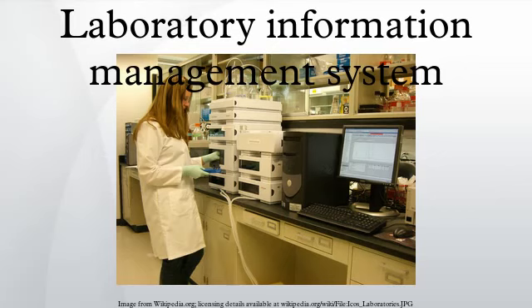Standards. A LIMS covers standards such as 21 CFR Part 11 from the Food and Drug Administration, ISO/IEC 17025, ISO 15189, Good Laboratory Practice. See also: List of LIMS software packages, Virtual Research Environment, Laboratory Informatics, Electronic Lab Notebook, 21 CFR 11, Data Management, Scientific Management, Process Development Execution System.